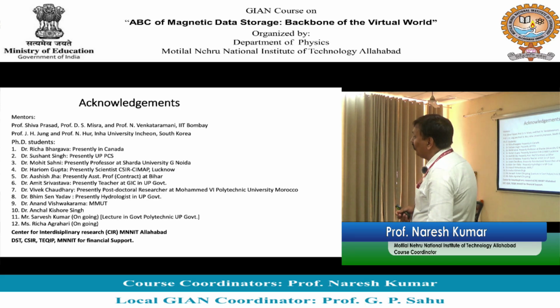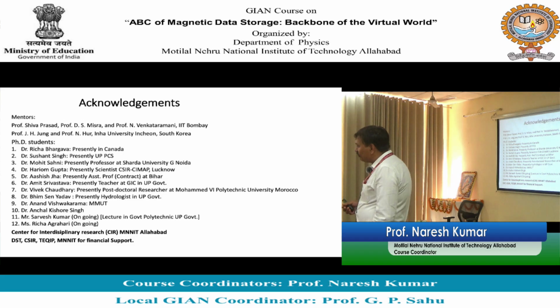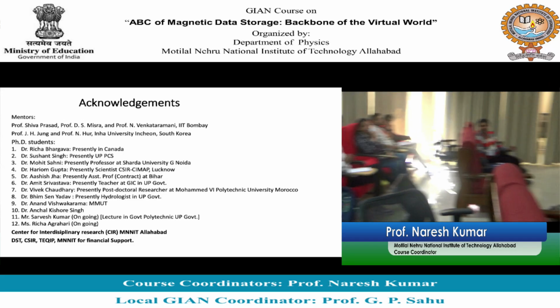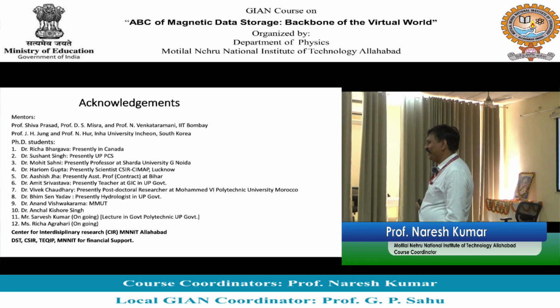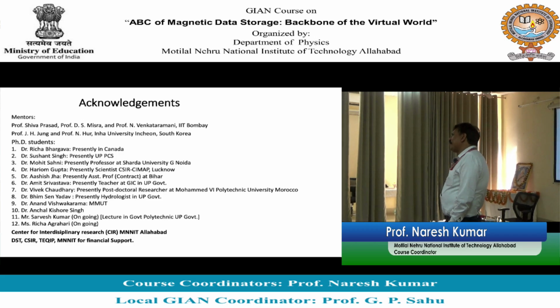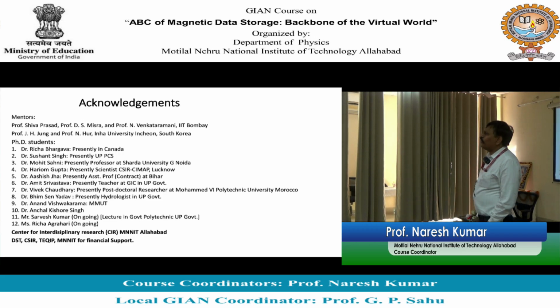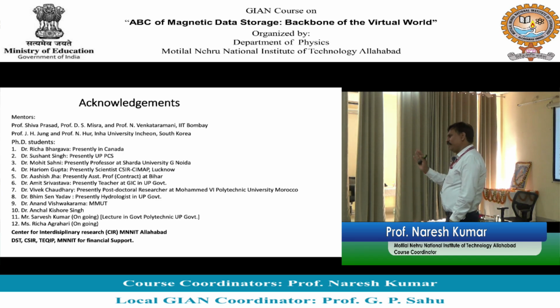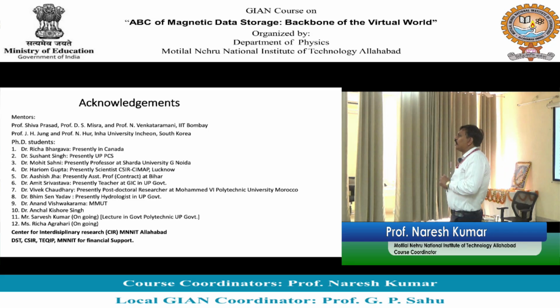Yes, please. K is a correction factor. कोई ना constant है. 0.9 के आसपास आता है, करेक्शन फैक्टर है. मैंने उस पर emphasis नहीं किया. कोई नंबर ले लीजिए, वैसे 1 मान लीजिए. चलिए मैं आपको k is equal to 1, it's a number. k मैंने 1 कर लिया है. Basically this Scherrer formula मैं जैसे बताऊं आपको, ऐसे ही बता रहा हूं.